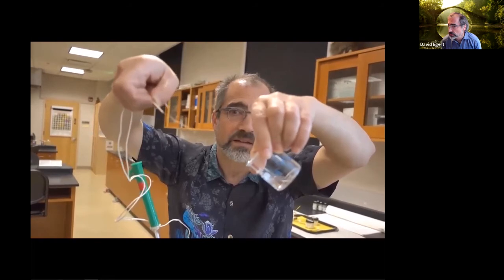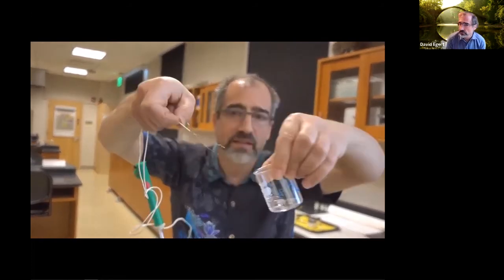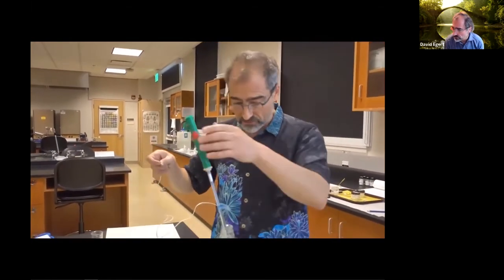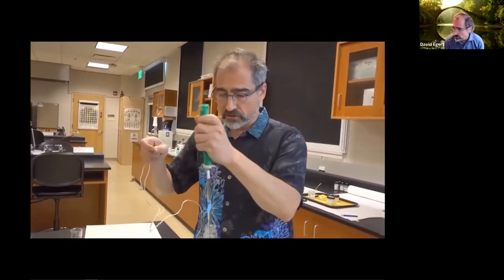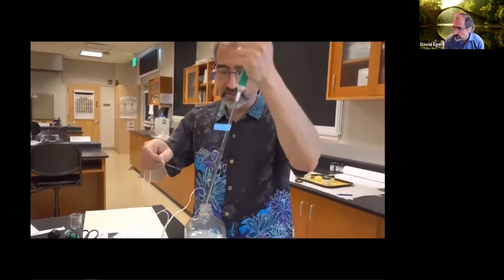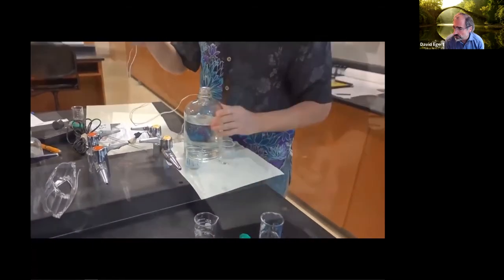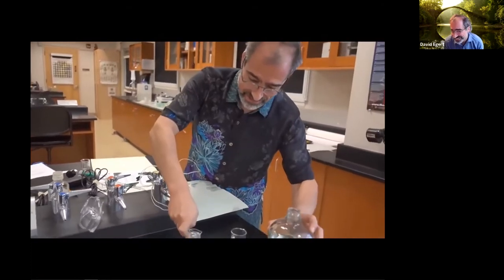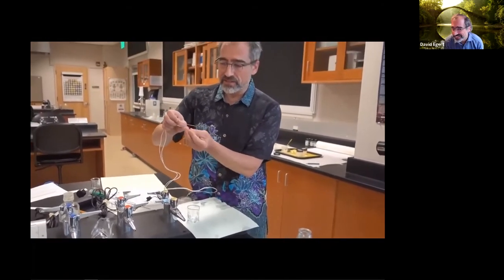All right, so on the air, I don't hear anything. In calcium chloride, I hear a buzz. I can rinse these little guys off with some distilled water because I want to make sure I'm not cross-contaminating stuff. Normally I would just have a little beaker and do that. So I'm cleaning these off.